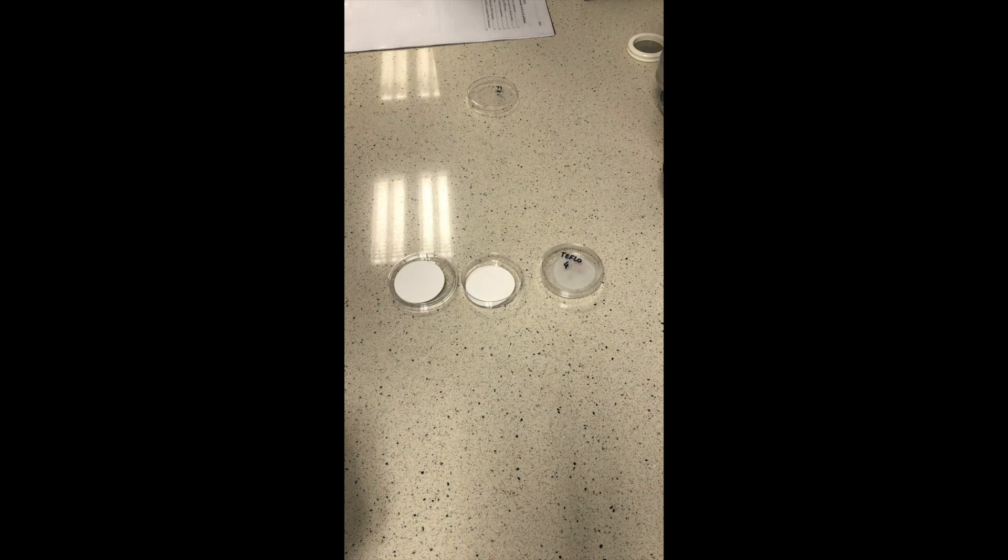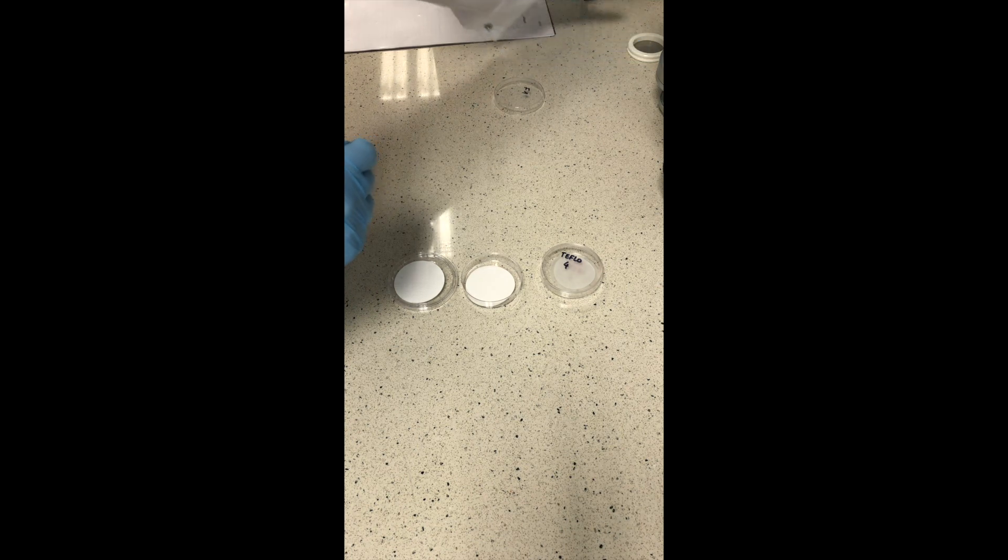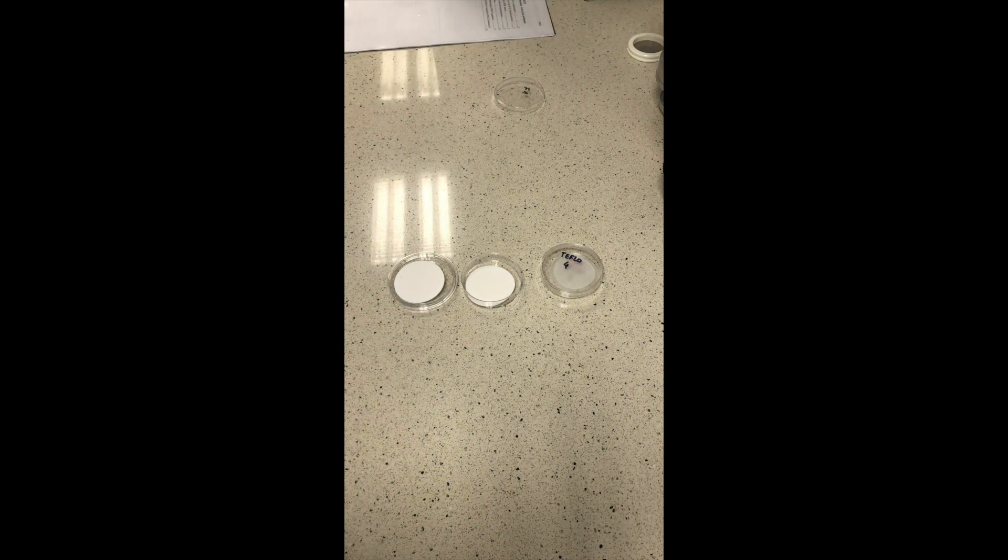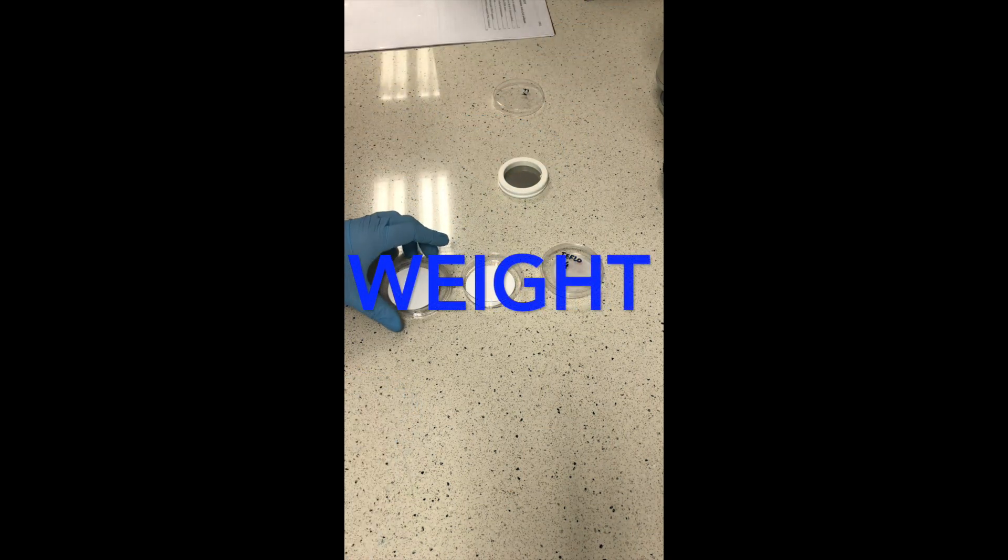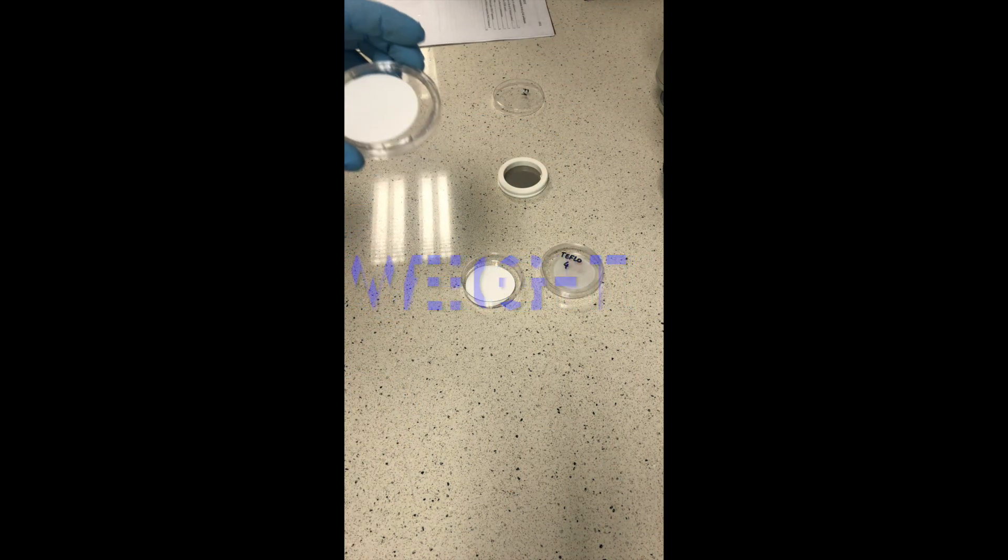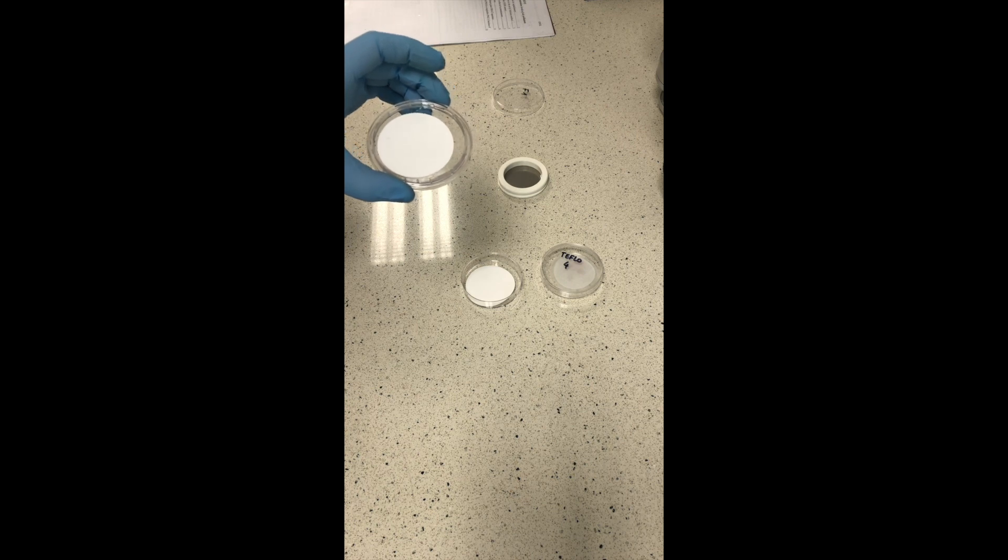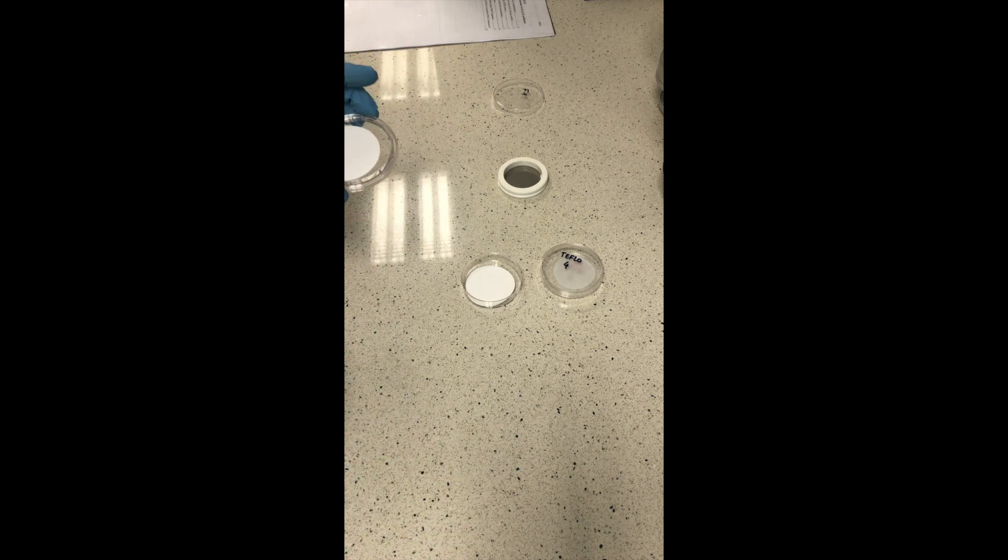So what do we do? We will use the sampler. I will show you in a moment the sampler, but first we have to weigh the filter. We use the balance to weigh the filter first before exposition and next after exposition.